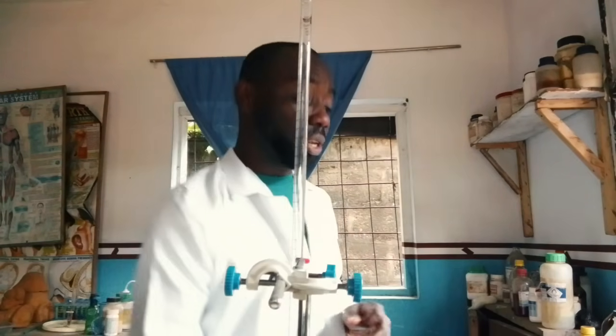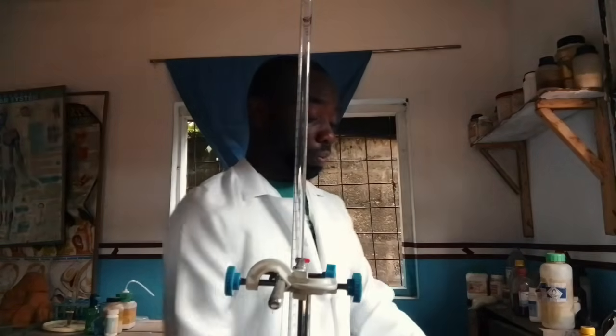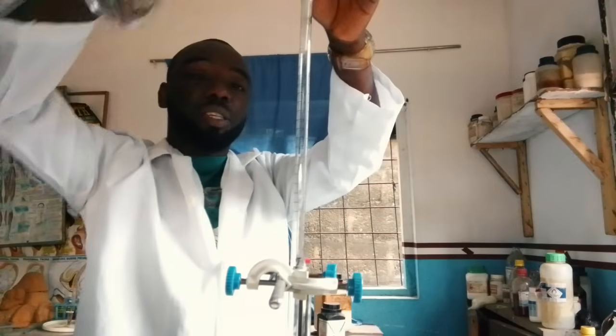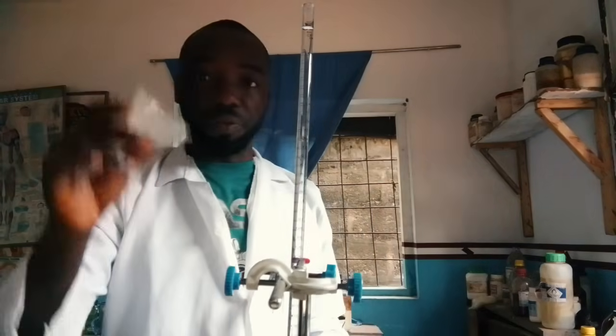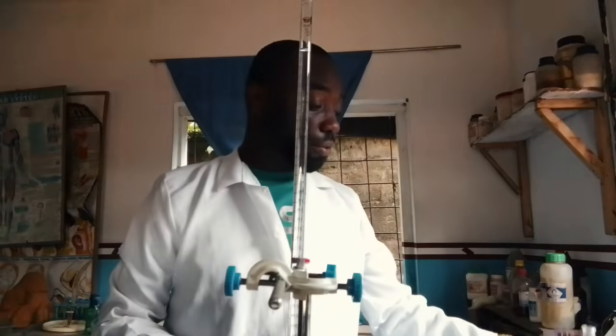So in today's tutorial, I'll be adding our acetic acid. So here I have my funnel. I put my funnel, and this is my acetic acid. I'm going to be filling it up to the 0 level. But before you do that, you first of all remove the funnel, so it is at the 0 level.